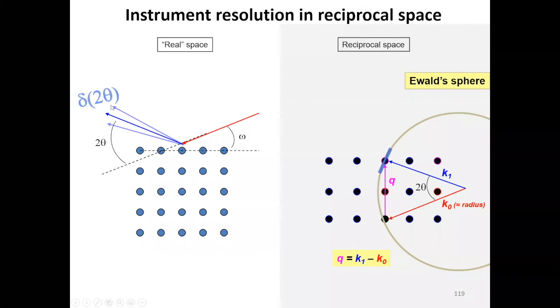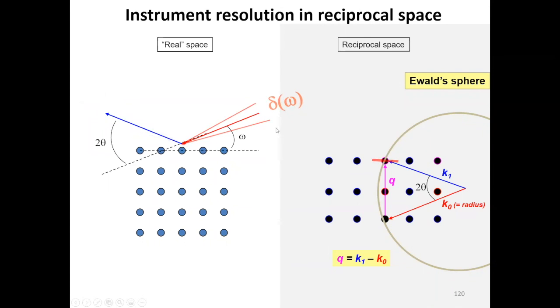This is done by adding some layers of crystal diffraction in front of the beam or before the detector, or using very small apertures in the detector. We have all these varieties in our lab. This is typically used for cases of epitaxial growth. You have the substrate here in one case. The sample is actually strained with a larger lattice parameter. The substrate is smaller or relaxed.